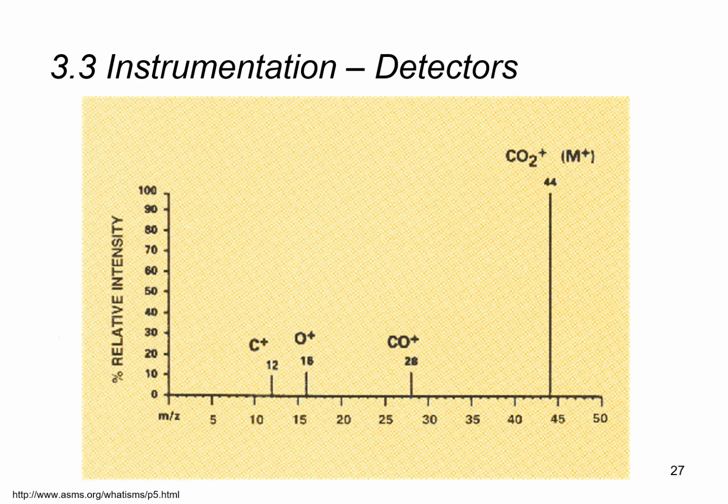We have a line that indicates the signal intensity for each of the molecular masses. For example, if we are looking at ethanol, there will be a line showing up at ethanol's mass, and the height of that line will give us an indication of whether there's a lot of ethanol present in the sample, or just very little.